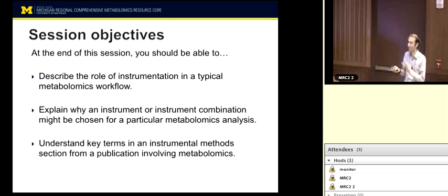Okay, so instrumentation and omics science. This is one of those questions of, does the science drive the instrumentation to where it needs to go, or does the availability of a technique drive the science? An analytical chemist would make an argument for the latter half. Maybe a molecular biologist would say the other way around. But really, both things are inextricably linked.